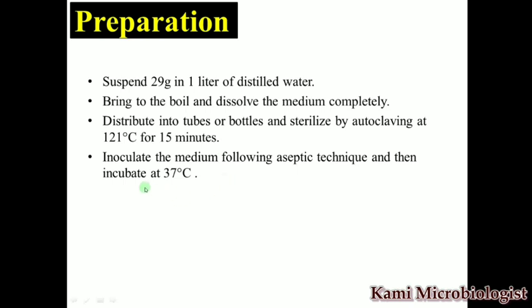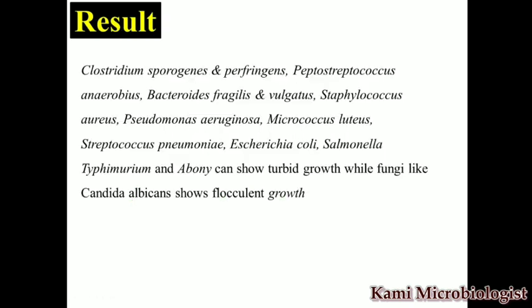So now once the media is poured and the media comes to room temperature, then you have to inoculate your bacteria using aseptic technique, and you will incubate your bacteria at 37 degrees Celsius. The result will be that a lot of bacteria can grow because it is enriched media.